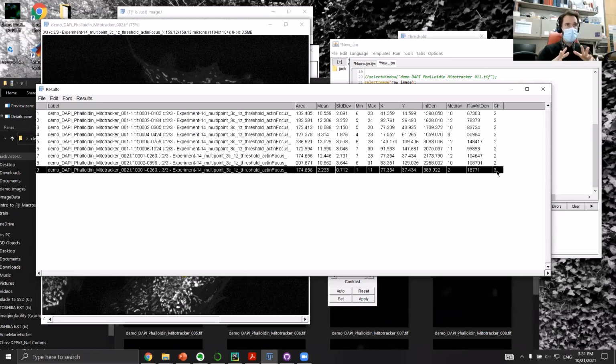We have just a few minutes left. And so I would like to show you one last thing. Since we don't have much time, we'll just jump through somewhat quickly. I can stay around also on Zoom if there's other questions or concerns. But is everyone okay with seeing one last thing, or do you want to process this a little bit more?